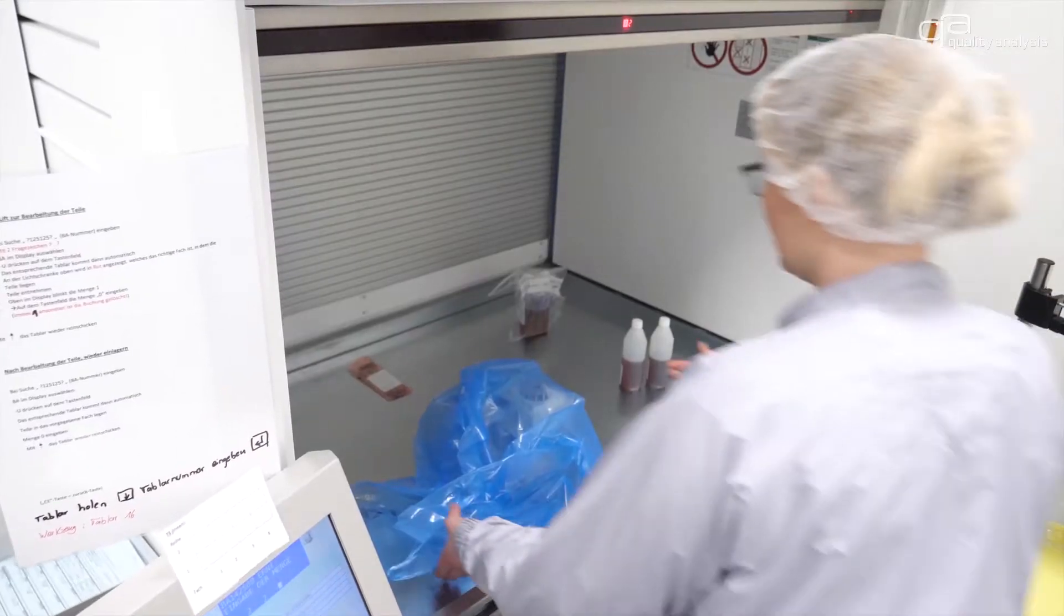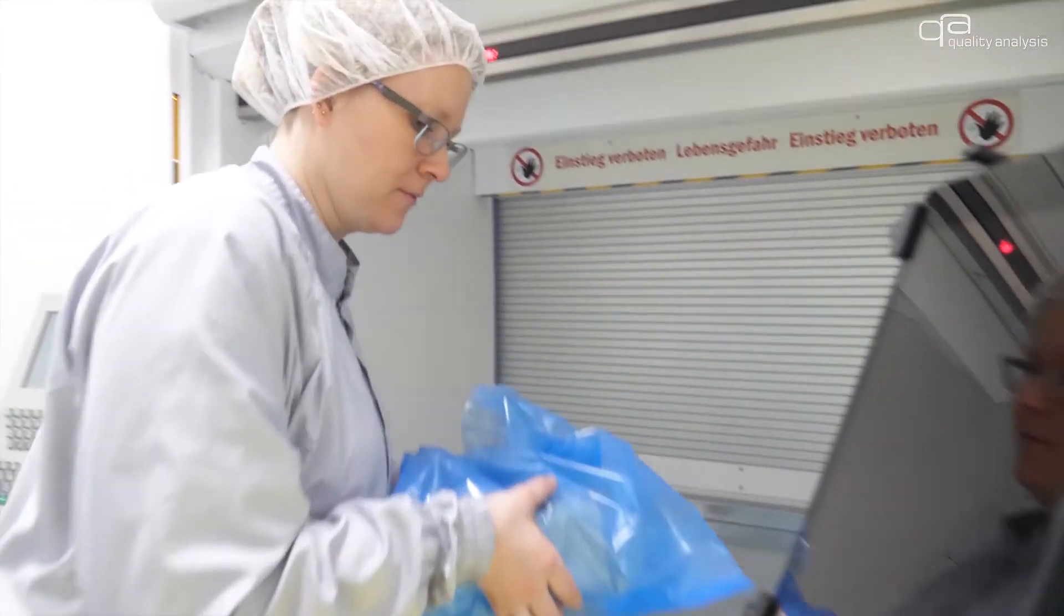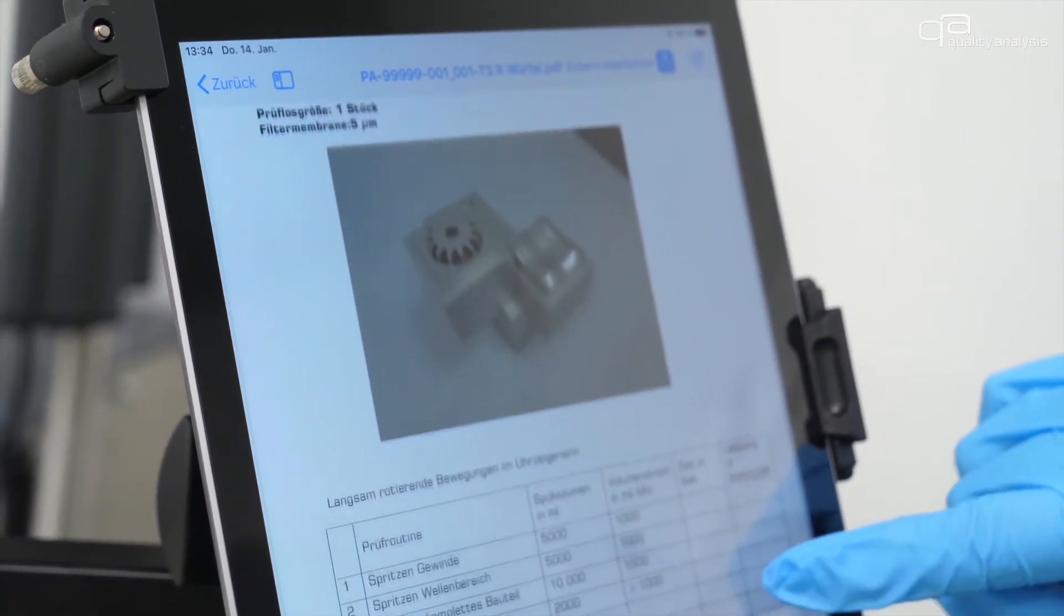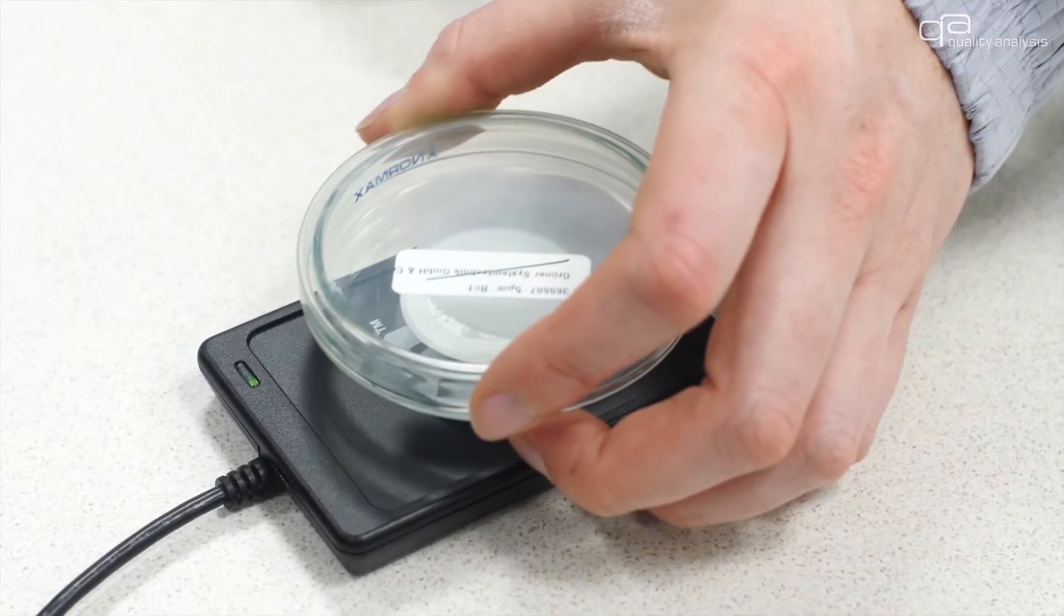Before analysis all components are placed in an airlock and registered. The entire laboratory organization runs online via a special laboratory management system.